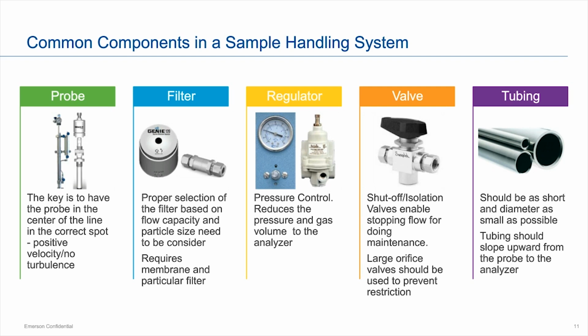The next item I'm showing is a regulator. Again, especially for gas systems, but obviously also critical for liquids, we need to get, for gas, the pressure down from a few hundred psi to the 10 to 30 going into the GC. You'll need a regulator to do that. Again, there's a multitude out there, so it's up to what regulators you have a personal preference for. Talk to suppliers. If you come into us and we're designing the system for you, we will make the recommendation.